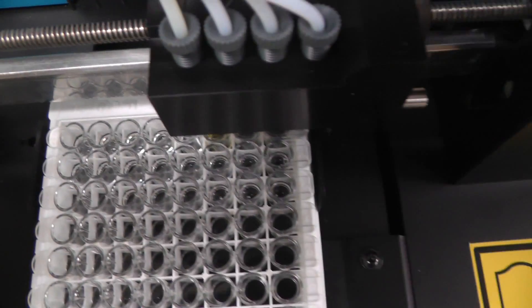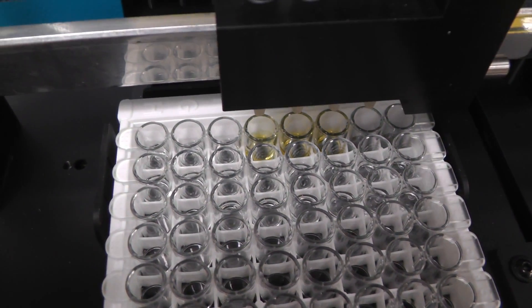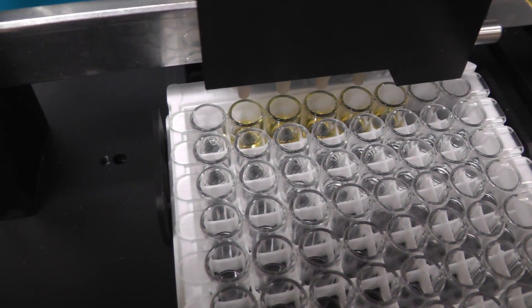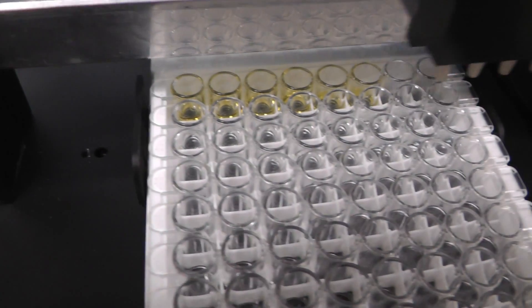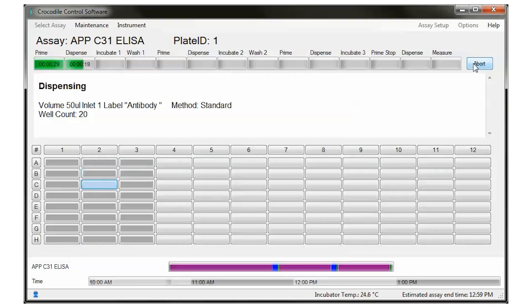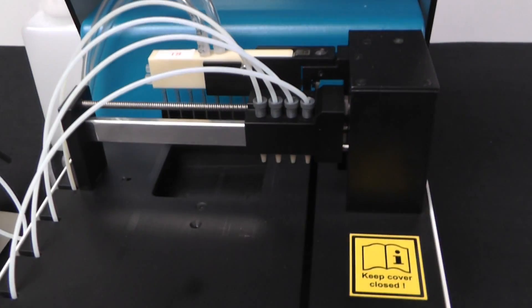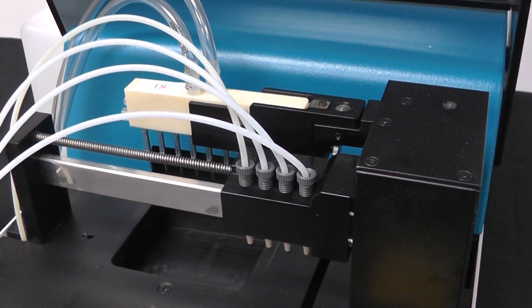We dispense 50 microliters of antibody solution into each well except the blank. Now we shake the plate for one hour in the incubation chamber.